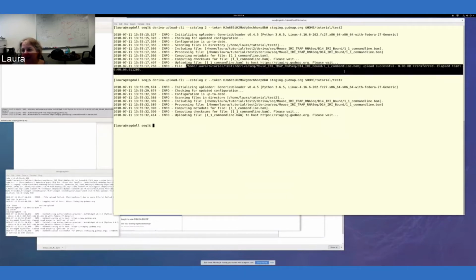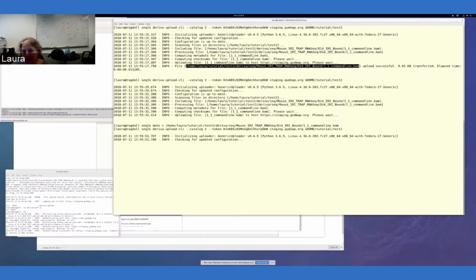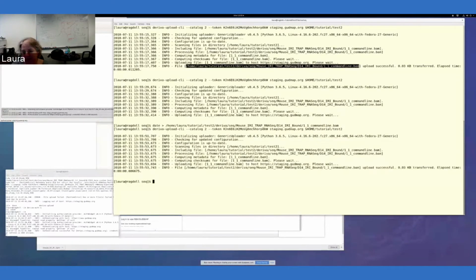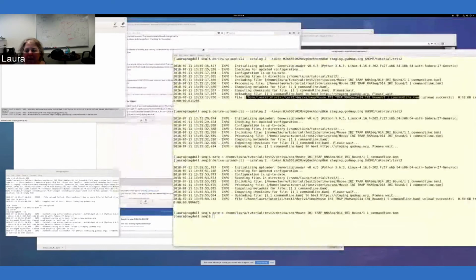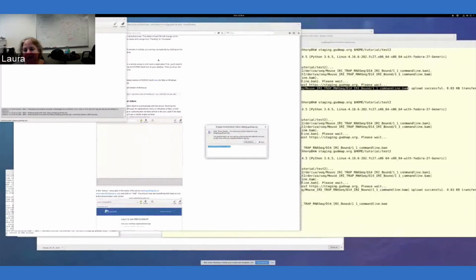If I change the contents of this file and then rerun it, you'll again see that it says upload successful. Okay, so I'm going to change the contents of the file again. But now let's just say I'm done with all of the uploads that I want to do.